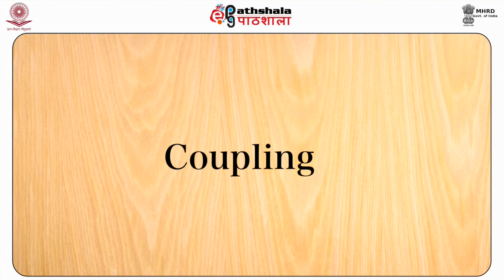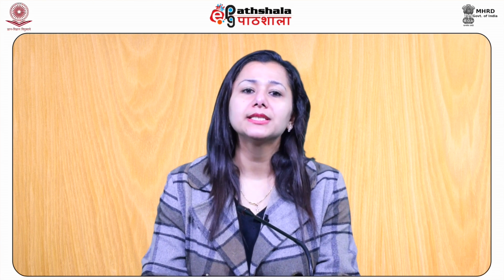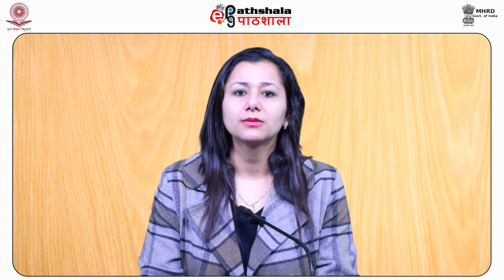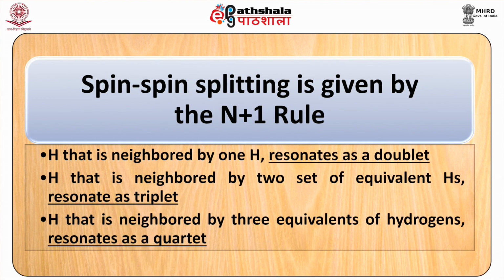Now, looking at what is coupling. J coupling arises from the interaction of different spin states through the chemical bonds of a molecule and results in splitting of NMR signals. This coupling provides detailed information about the connectivity of atoms and the structure of a molecule. Spin-spin splitting is given by the following n+1 rule.